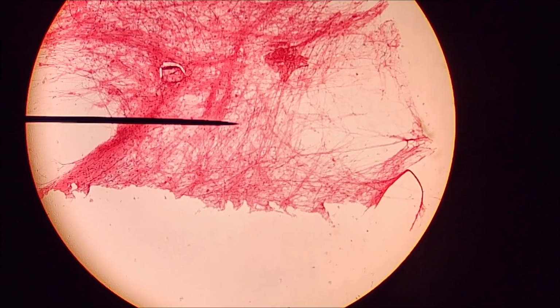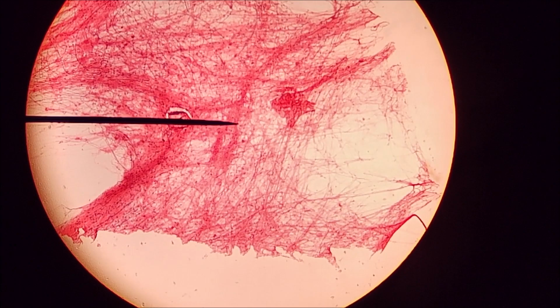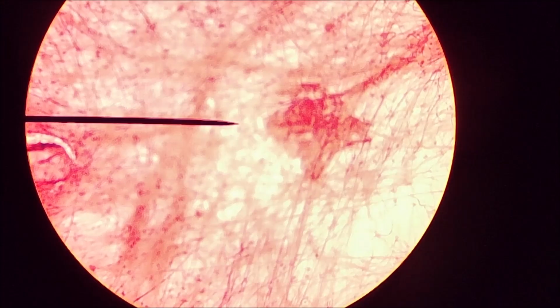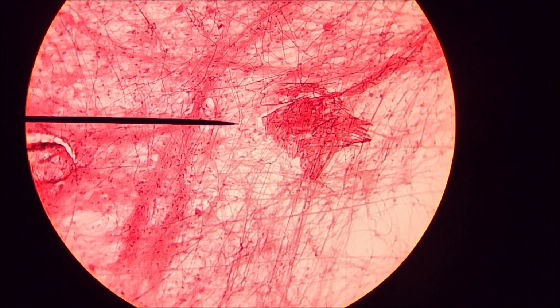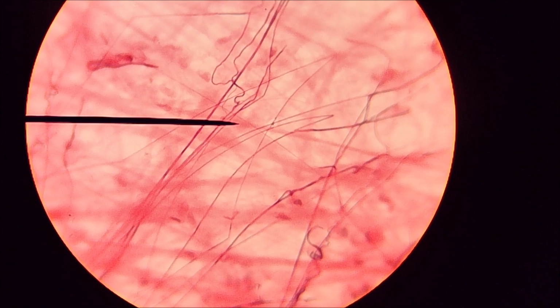What we have here is areolar connective tissue. You can kind of see what it looks like. This is just a bunch of fibers that's been torn off of probably a basement membrane someplace. We can zoom in a little, like so, and you can see all of this fibrous network. Going in a little further, what I want you to notice is the thin, darker fibers, like this one here in the foreground, that is an elastic fiber.